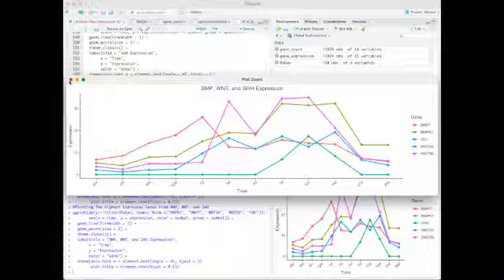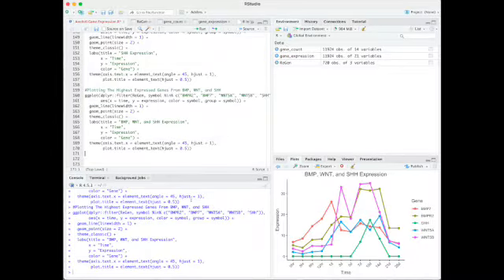While all genes within this data are important in regeneration, it is also important to analyze specific genes which have similar interests. I hope that this manual gave a better representation of axolotl gene expression during limb regeneration.